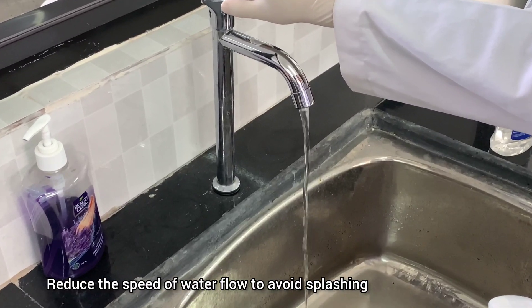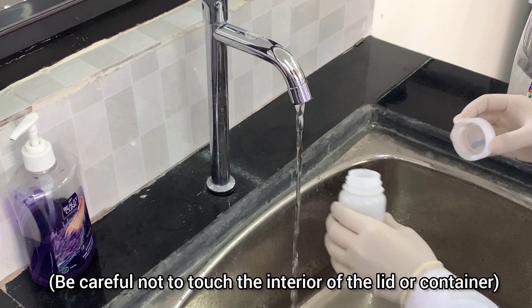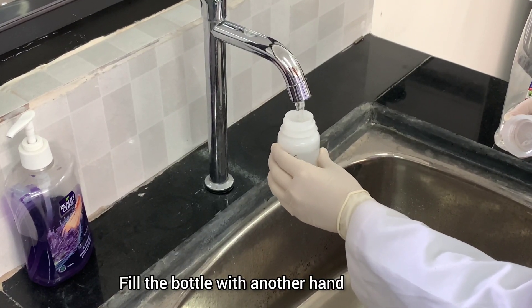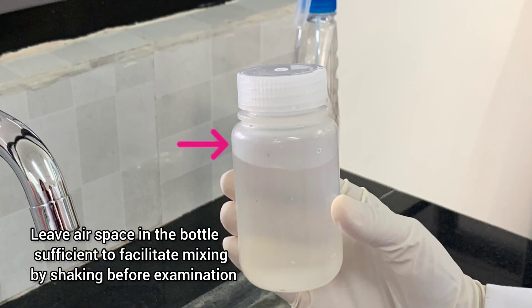Reduce the speed of water flow to avoid splashing. Remove the lid of the sample container with one hand. Be careful not to touch the interior of the lid or container. Fill the bottle with the other hand. Do not overfill — leave air space in the bottle sufficient to facilitate mixing by shaking before examination.